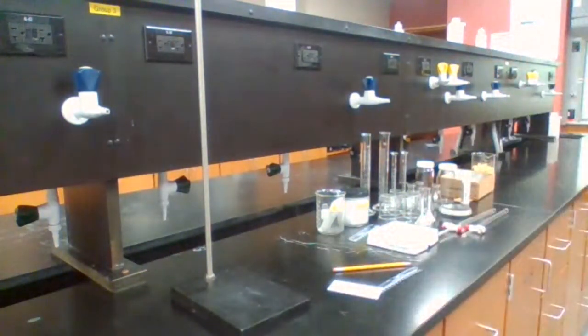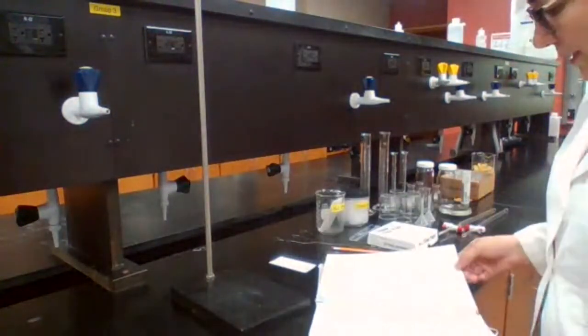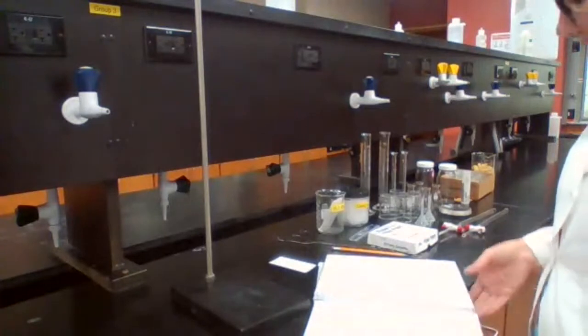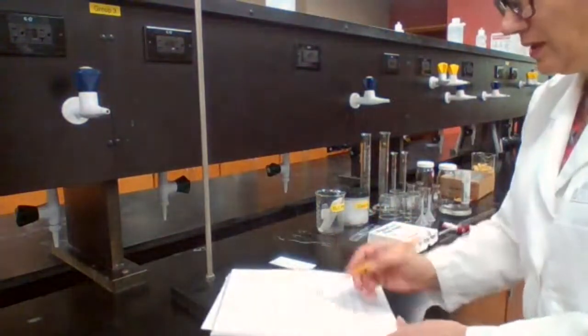Bring my lab manual. In the lab manual, I'm going to sketch what is going to go on each one.